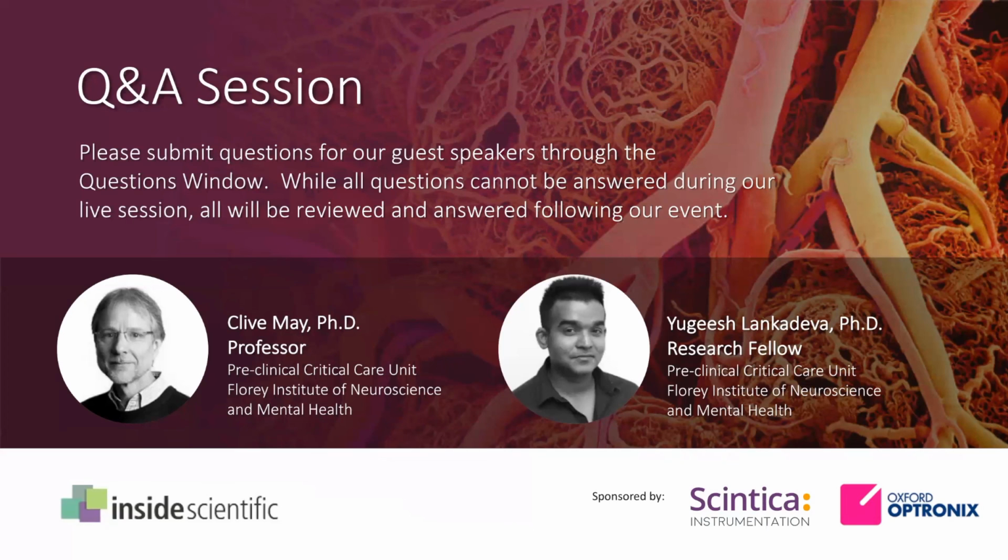Right, that's interesting. I guess I was getting at whether you were reducing the sampling rate, and that is a key feature on our oxygen monitors, that the user can dial in the sampling rate to suit the experiment, given that there is an accumulated lifetime limitation on the oxygen sensing part of our monitors.